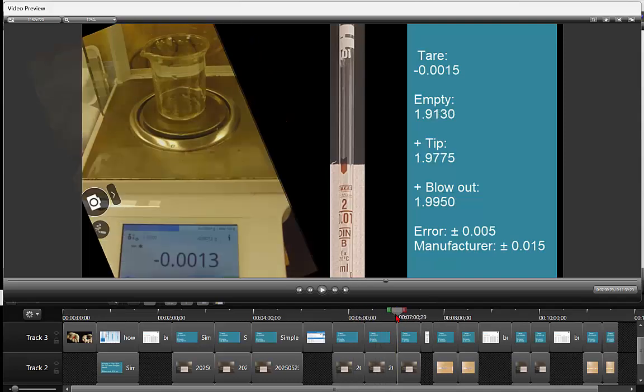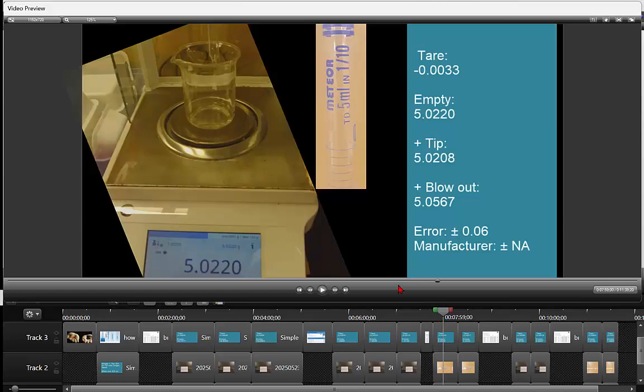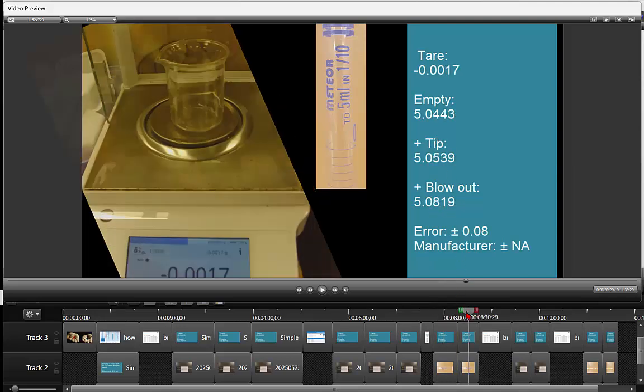Okay, now once you get to some dodgy things, like this is one of the American ones I have. It has a TD, and then an IN, then a European IN, which means TC, and it's plastic, and I can't find this company. And it's got double bands as well to blow out. And so when I do it, it does have quite a large error that gets worse when you blow it out. And so it does seem with the double bands and IN that it's meant to be blown out, but you do not blow it out.